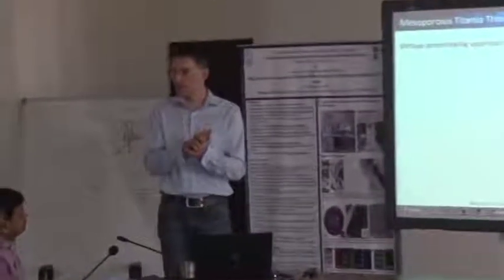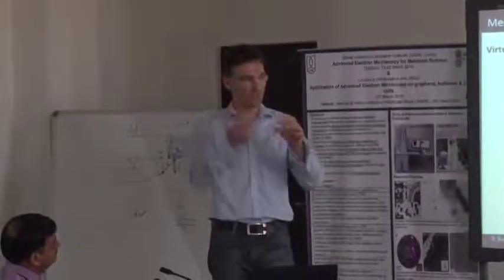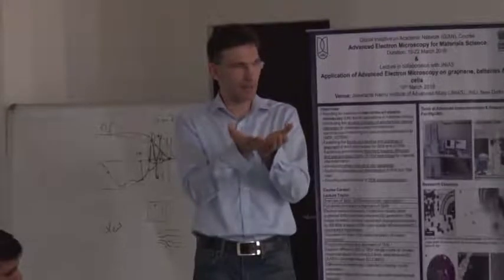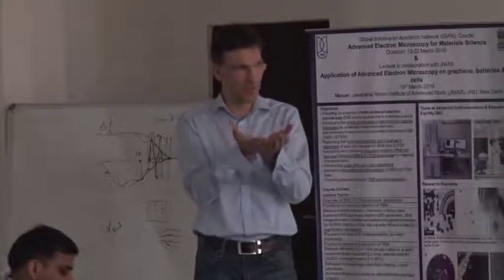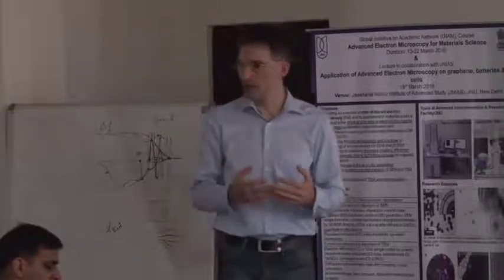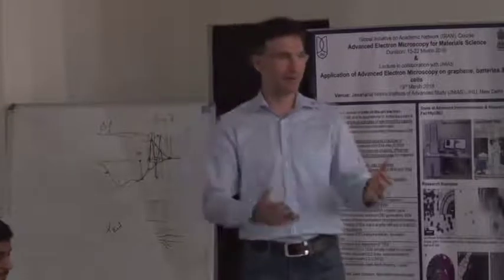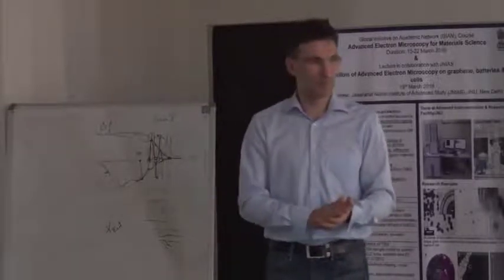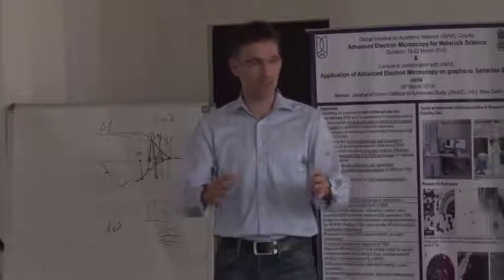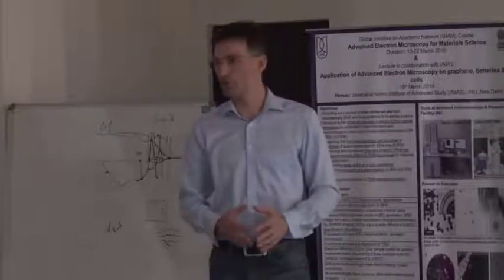And this already causes some trouble, because the magnification might slightly change. You do it mechanically, so you have to realign the height of your sample in the microscope, and by that you might introduce a minor change of your magnification, but that shouldn't be more than a tenth of a percent or so, because in the worst case, if the projections are larger than the first series, you would have to correct for that.